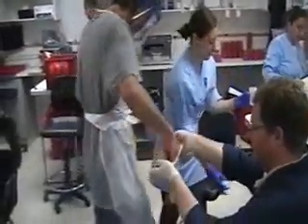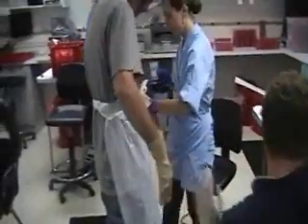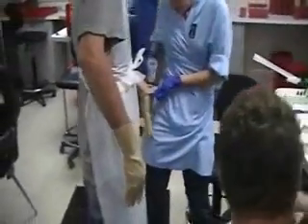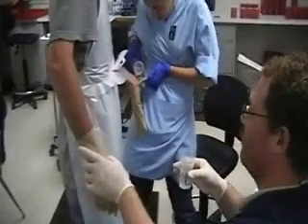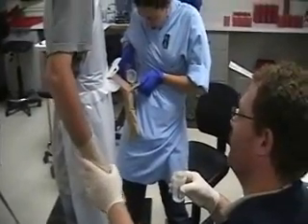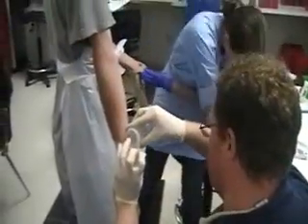This is the official glove juice sampling procedure. Sterile gloves are put onto the hands — this is post-product application. A sampling solution is then included into the glove.